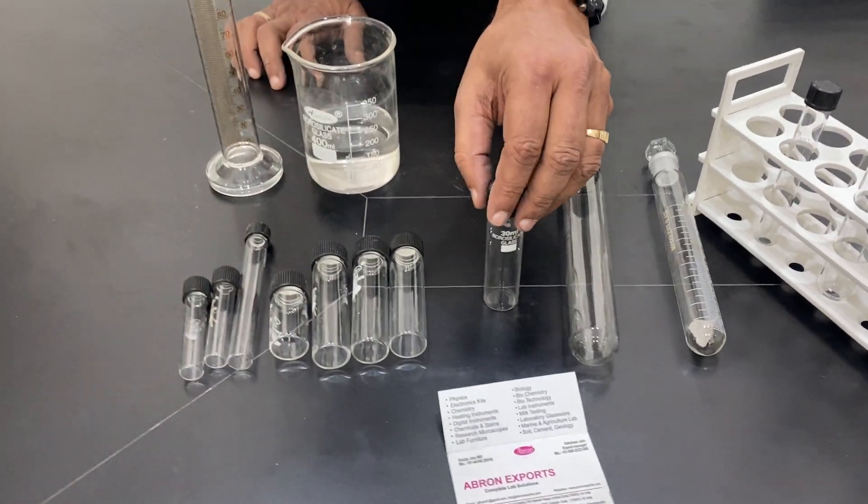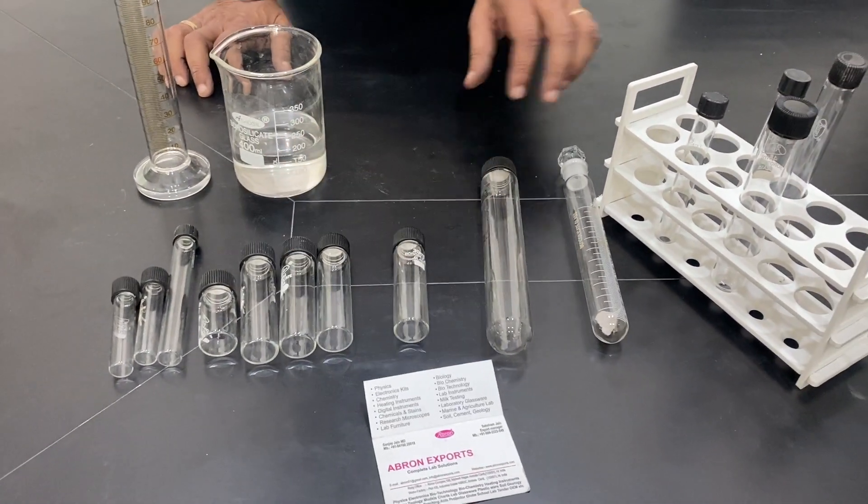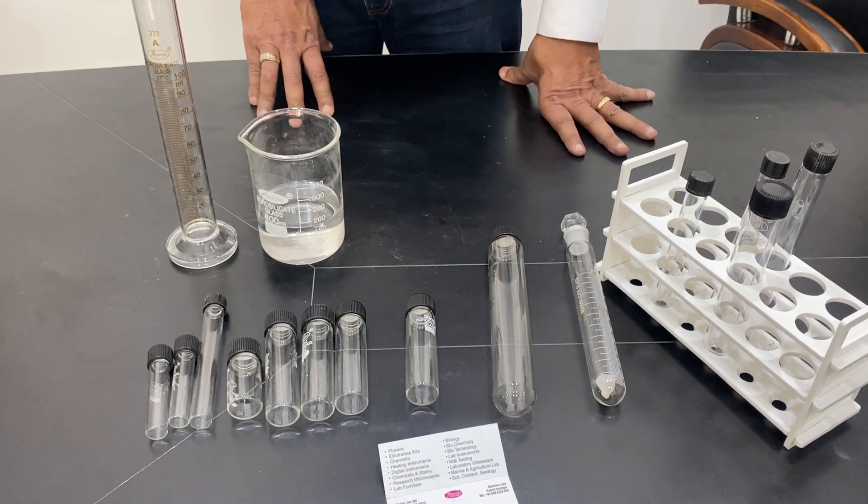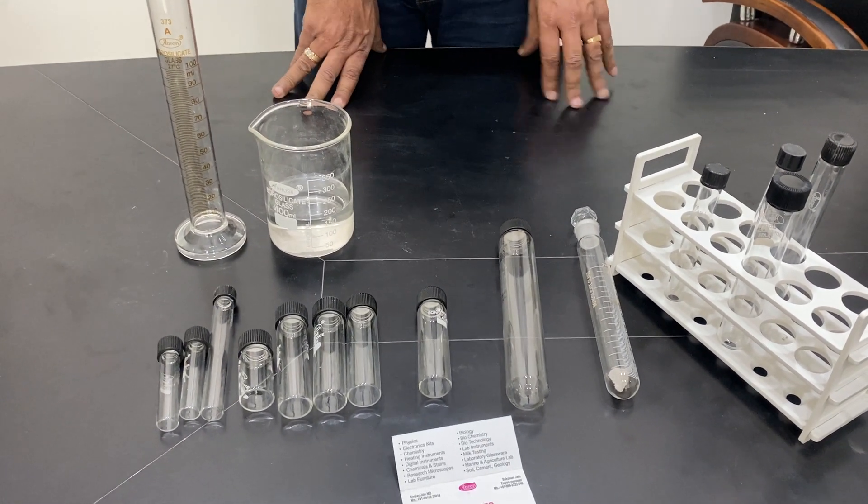These are with a standing flat bottom, approximately available in all various sizes as per microbiology and biochemistry lab requirements.